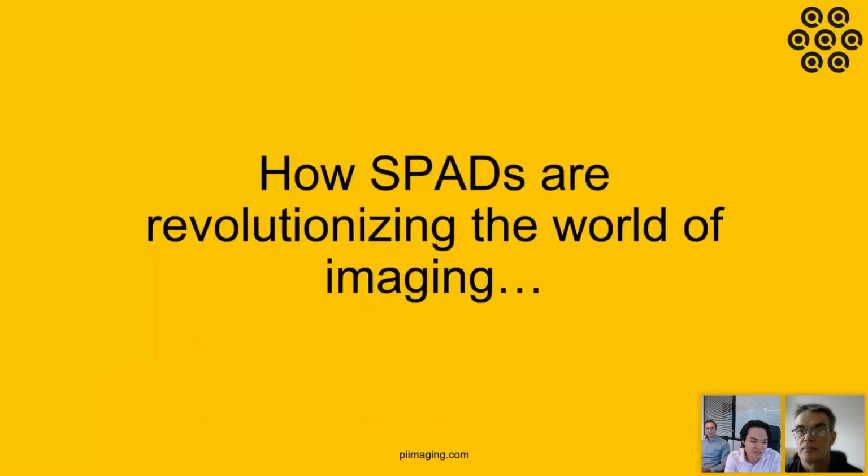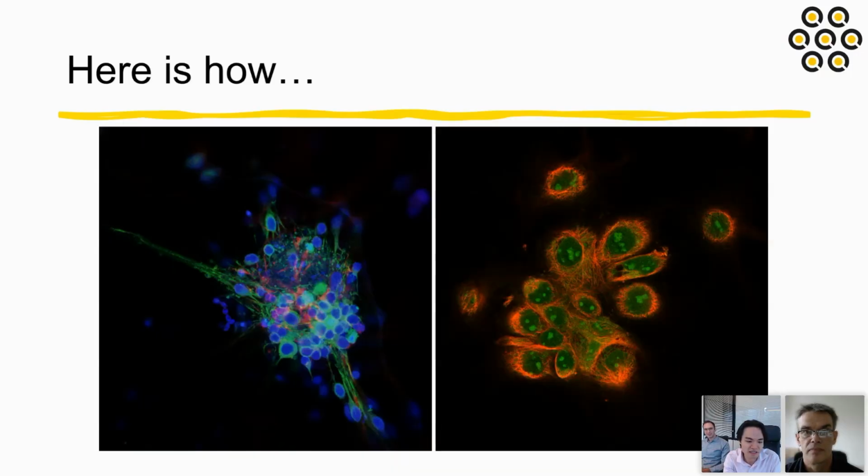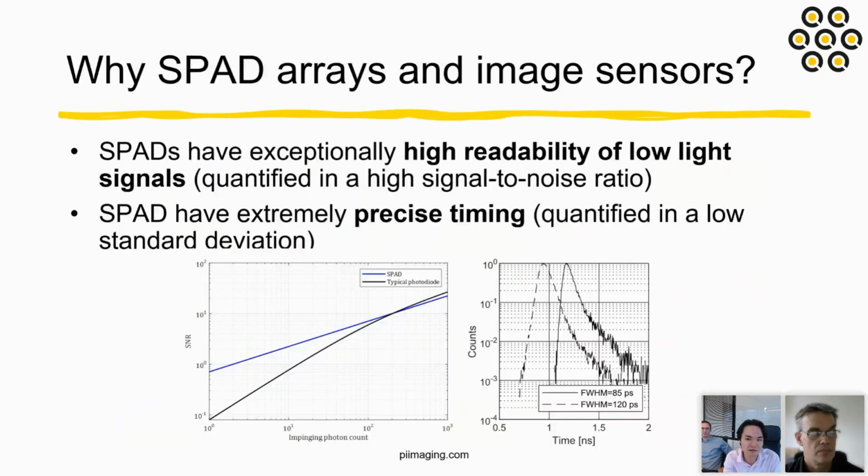So in today's webinar, we're going to show you how SPADs, or single-photon avalanche diodes, are revolutionizing the world of imaging. We will show you how we can help generate super-resolution microscopy images. But first, let's see why and when SPAD arrays and SPAD image sensors are helpful.